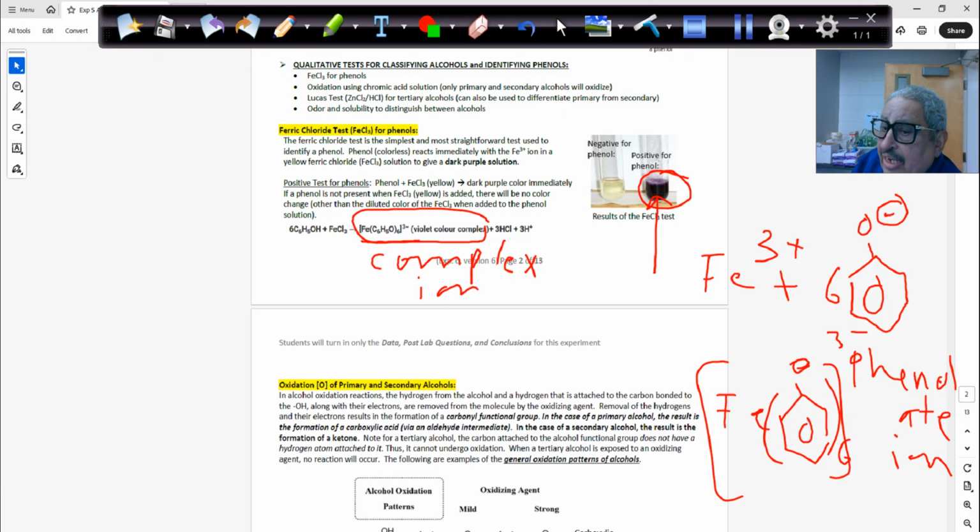Okay, guys, thus we distinguish a very distinct reaction for what? For phenol. That's a very distinct reaction for phenol, and this is giving purple to violet color. Correct? Now, with all other alcohols, there is no reaction. Iron chloride does not react with primary, secondary, tertiary alcohol. Iron trichloride reacts with the phenolate of the phenol molecule.